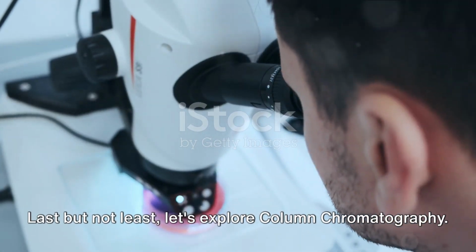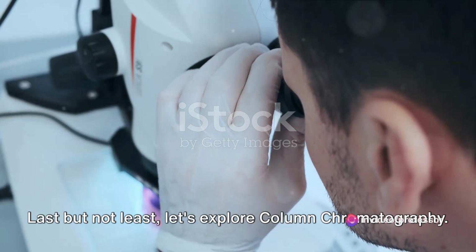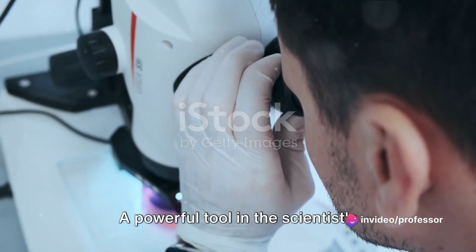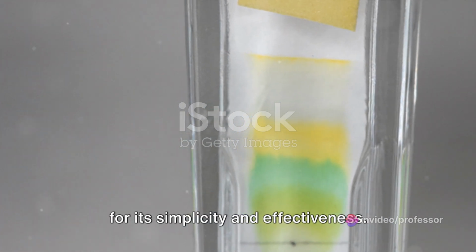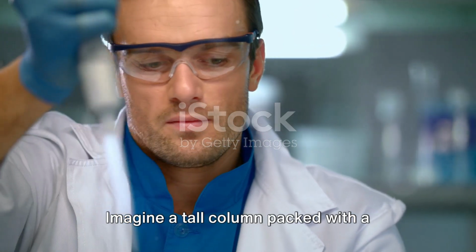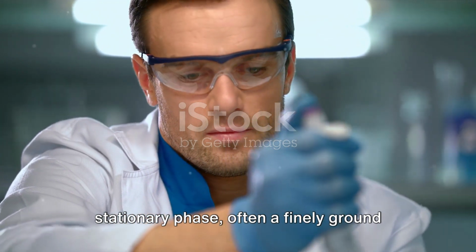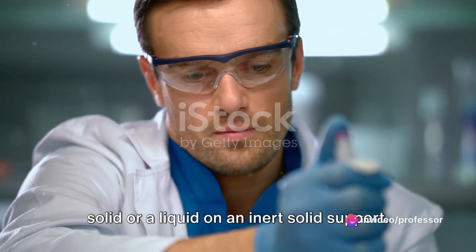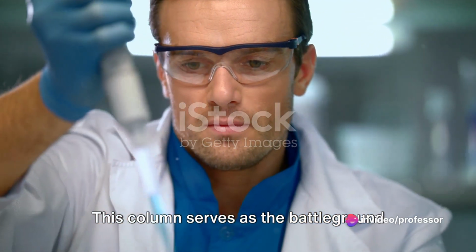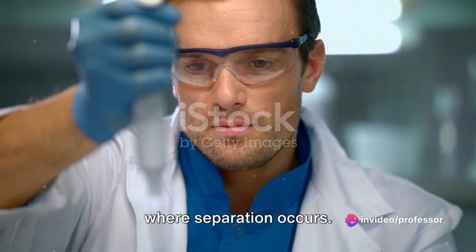Last but not least, let's explore column chromatography. A powerful tool in the scientist's arsenal, it's leveraged in labs worldwide for its simplicity and effectiveness. Imagine a tall column packed with a stationary phase, often a finely ground solid, or a liquid on an inert solid support. This column serves as the battleground where separation occurs.